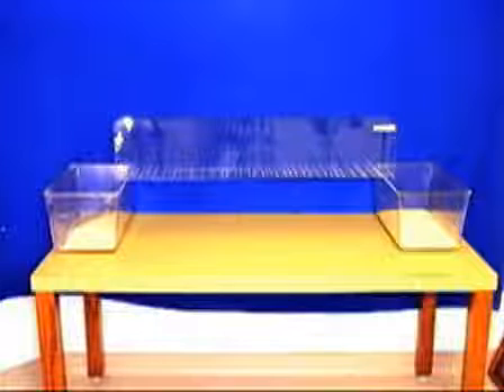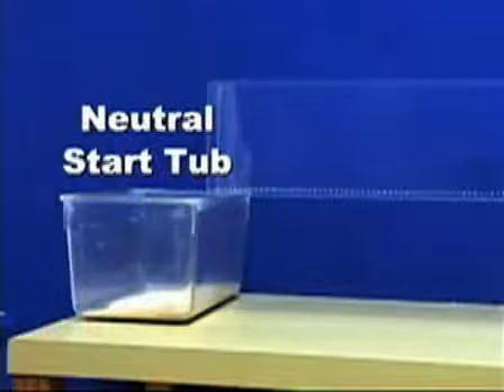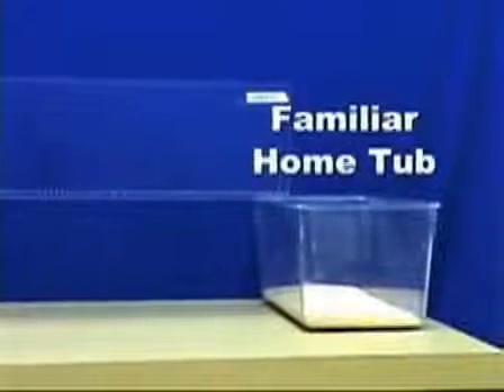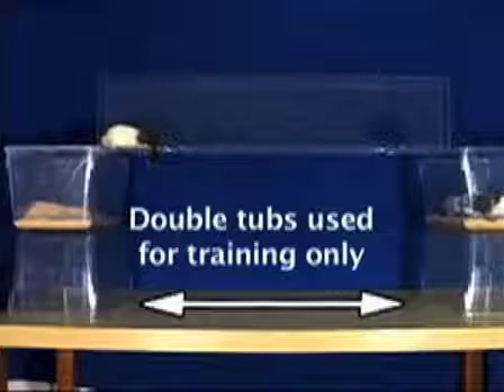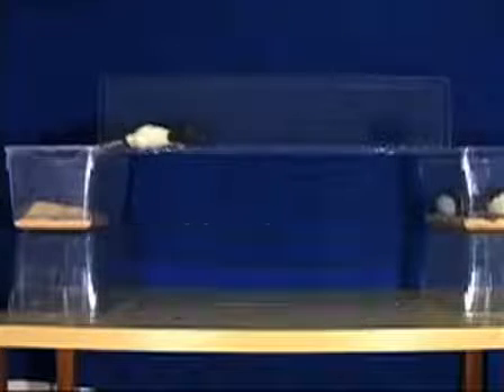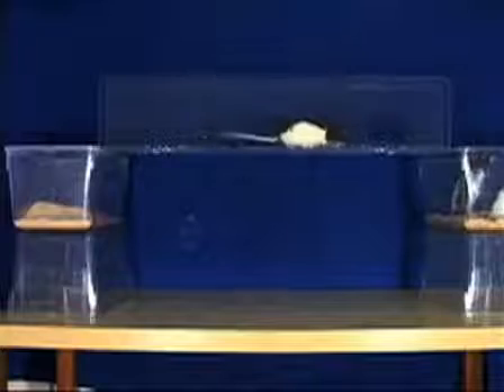Each end of the rung ladder apparatus is placed on a transport tub. At one end is a neutral starting tub and on the other end is the rat's familiar home tub. It may take some time for the test subject to begin and finish a crossing. To keep stress levels at a minimum, the rat should not be pushed or prodded — it is best to let the animal cross at its own leisure.